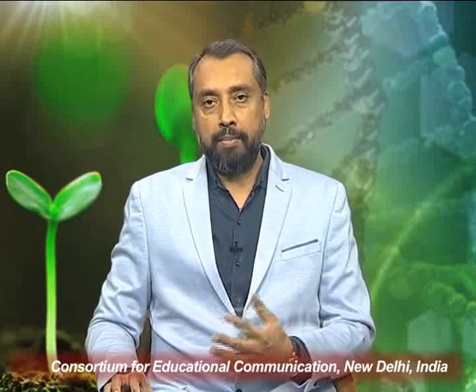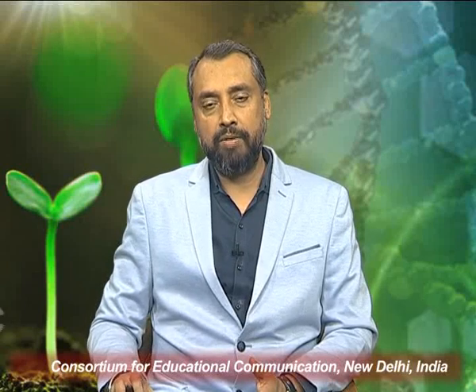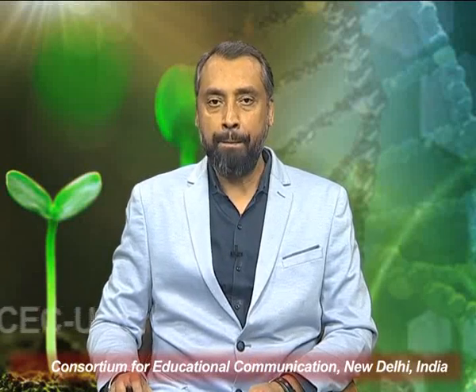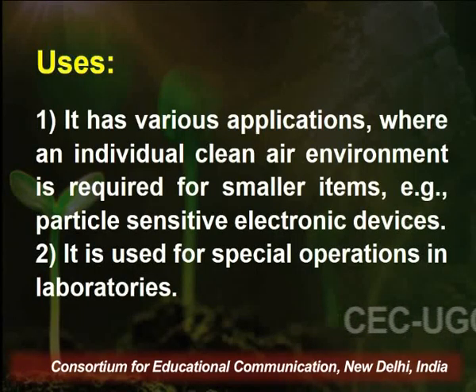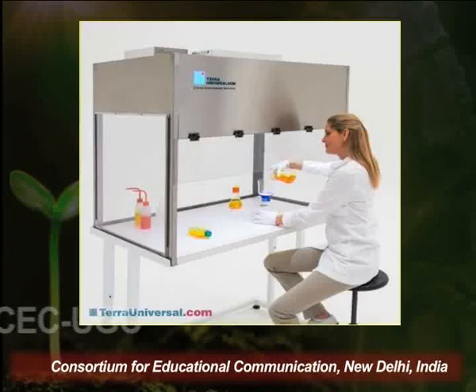A typical laminar flow looks something like this, which we can see with the help of a picture, and the uses happen to be an individual clean air environment if it is required for smaller items such as particle sensitive electronic devices. It is used for special operations in laboratories also. Here is a picture of a typical laminar flow.